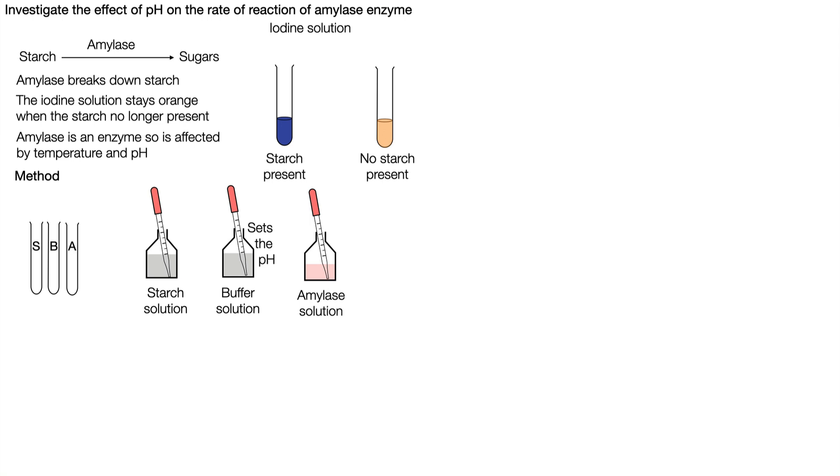We can then label our test tubes as starch, buffer, and amylase. And we can put some starch solution into our starch test tube, some buffer solution into our buffer test tube, and amylase into our amylase test tube.